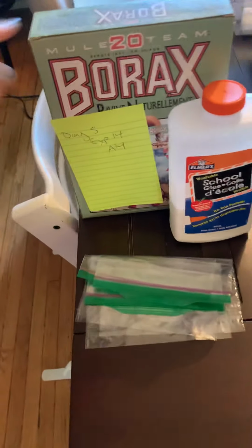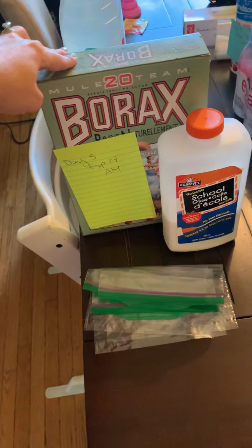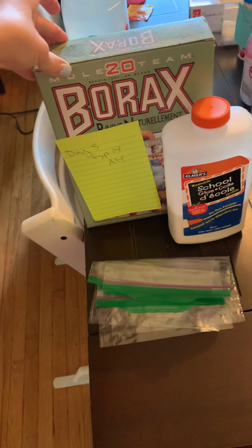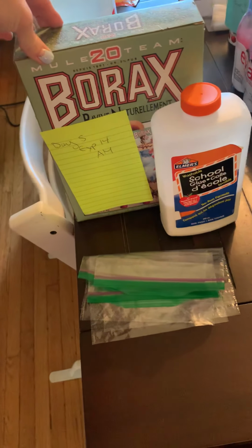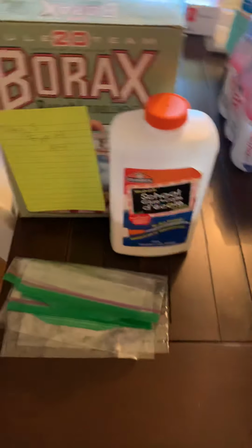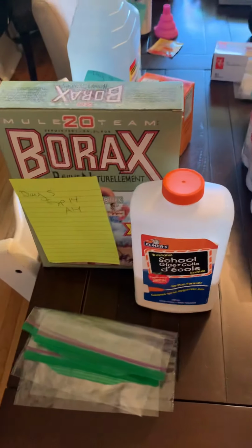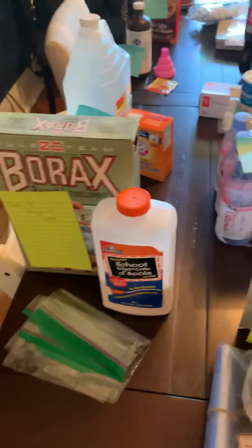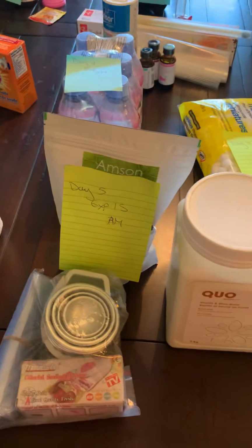All right, last day in the morning, we are doing organic chemistry. So we're going to talk about polymers, and we're going to make slime. This is the borax version, but some people have sensitivities to borax, and it's a detergent. So you can also use contact lens solution, or you can make oobleck with cornstarch and water. And that's all really fun to play with. And then just little Ziplocs. Some of these materials I'm using in multiple labs, which is why not everything's there.